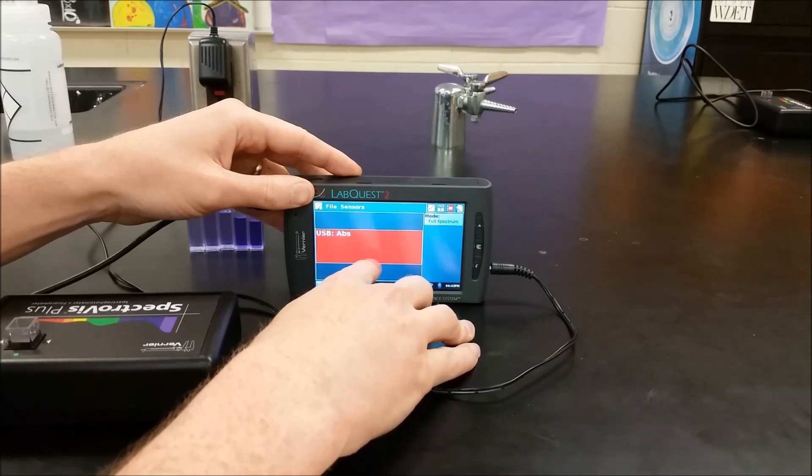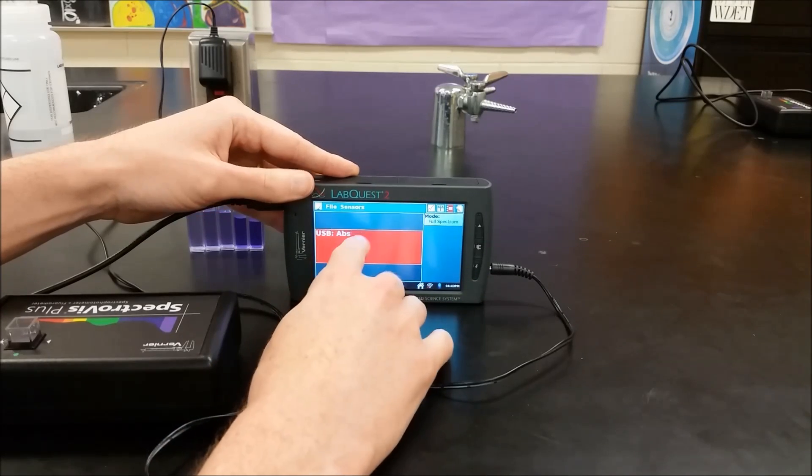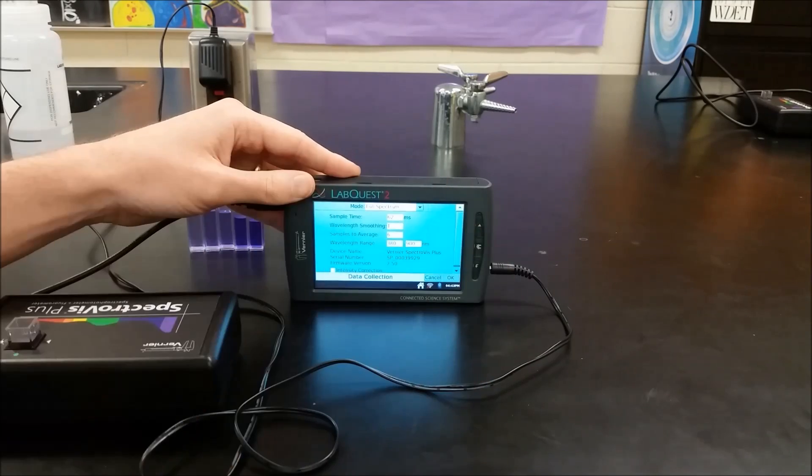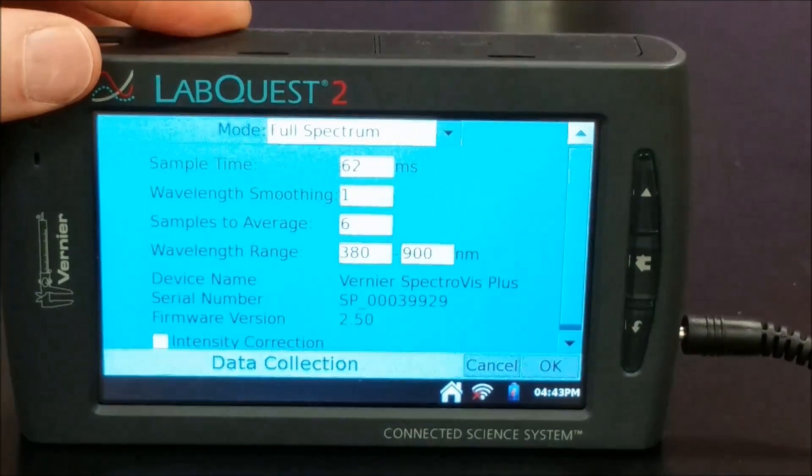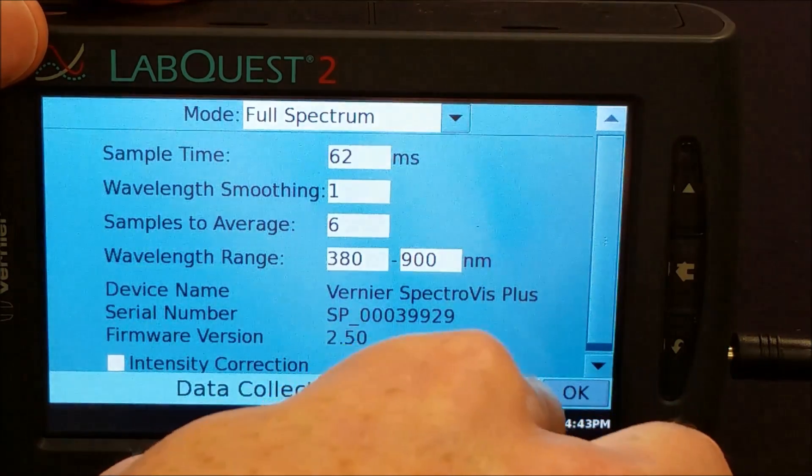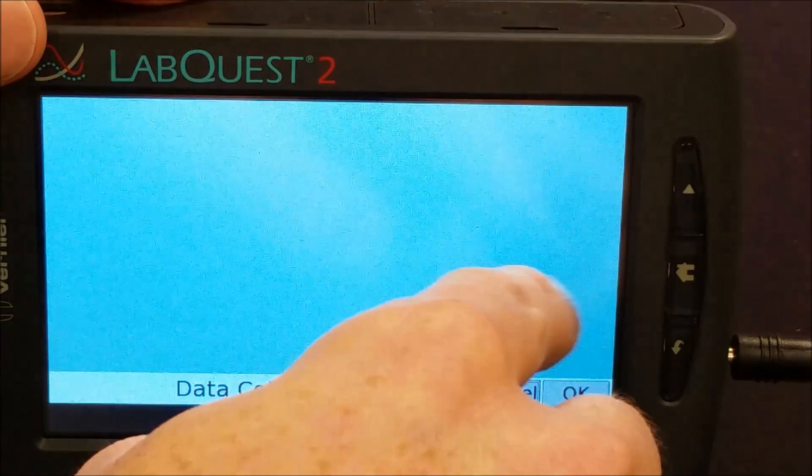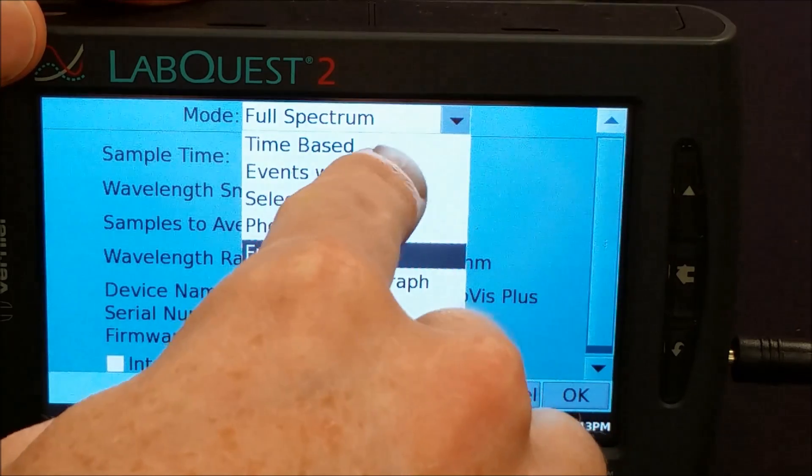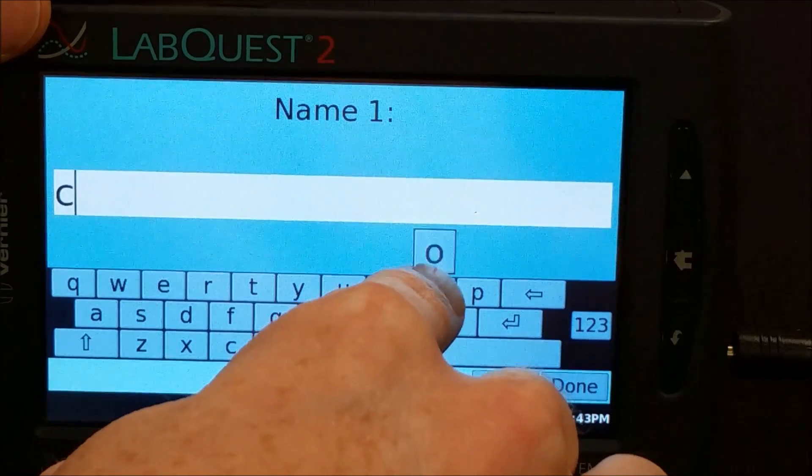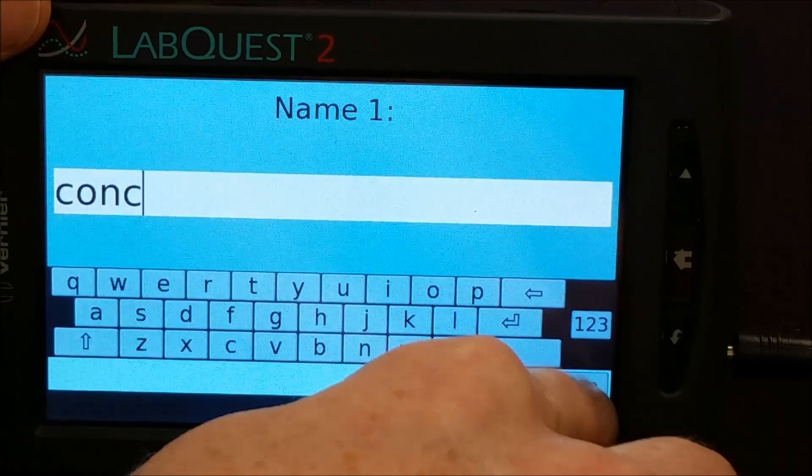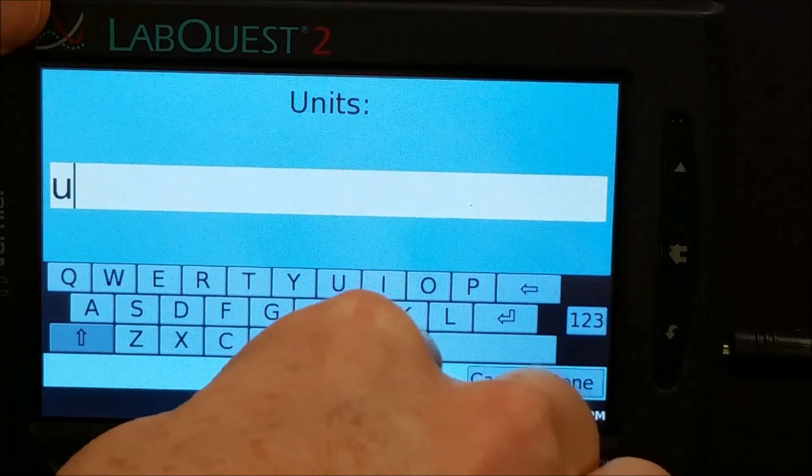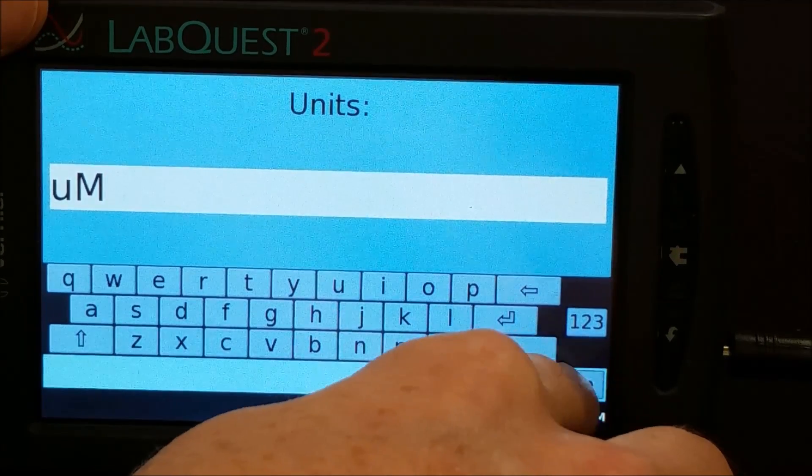So now it should give us a reading of zero, but currently we don't have it set to read because it's on full spectrum. So we're going to now go ahead and zoom in so we can follow along nicely. So we're going to click on Mode where it says Full Spectrum, and we're going to change that to Events with Entry. We want to plot concentration versus absorbance. So the machine is going to read the absorbance for us, and we're going to manually type in the concentrations. And these are going to be in micromolar.